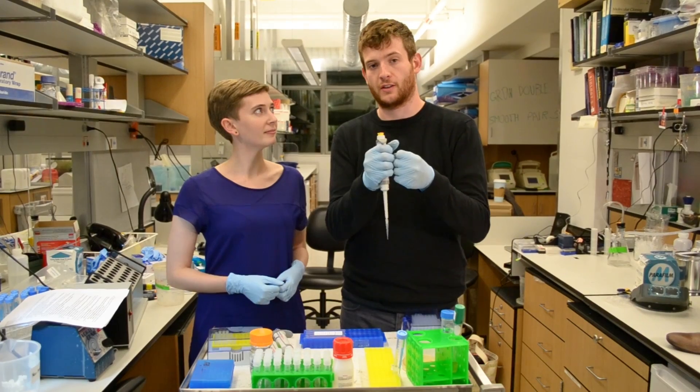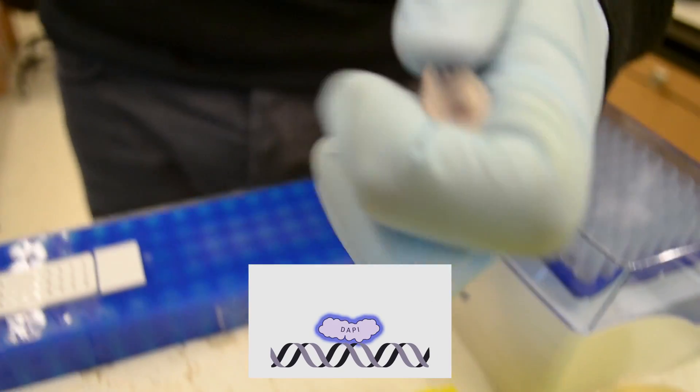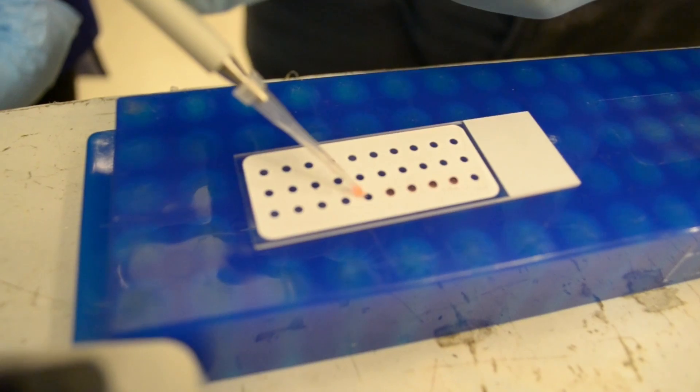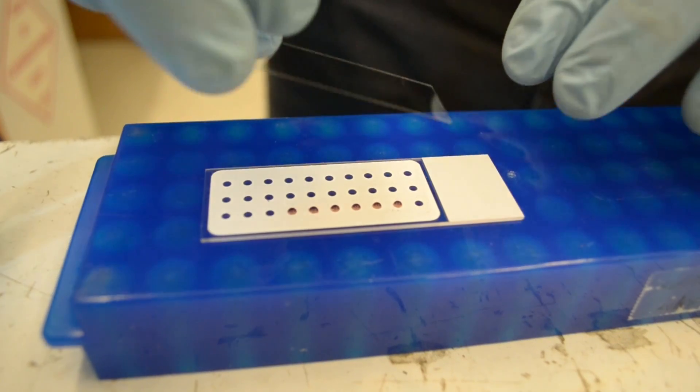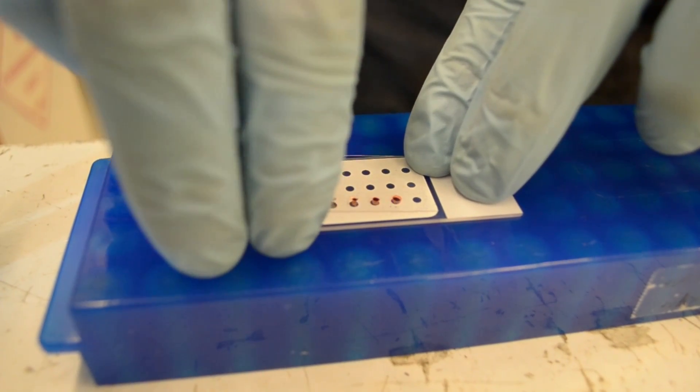DAPI is a dye that will bind the DNA, and when we look at it under a microscope it'll show up as bright blue. So now our cells are all ready. We just add a cover slip to the slide and this protects the cells while they're on the microscope.